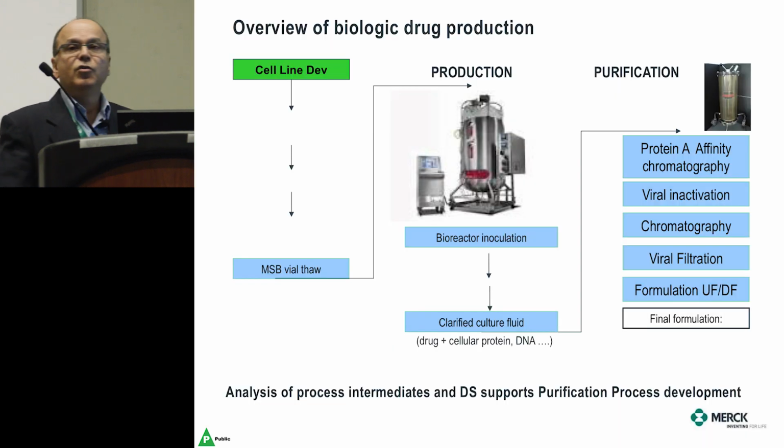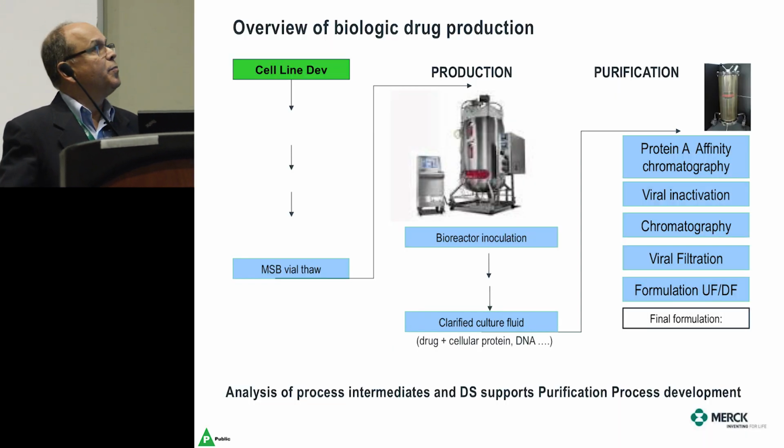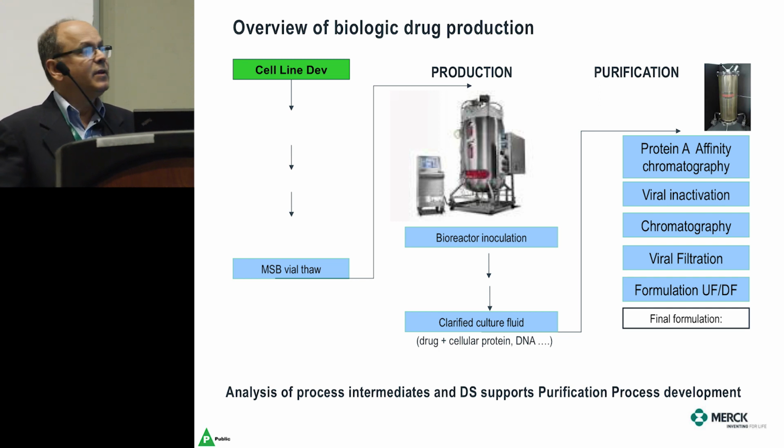This is an overview of drug purification production process, where cell line is developed, then you do a fermentation, and the output goes into several purification steps.